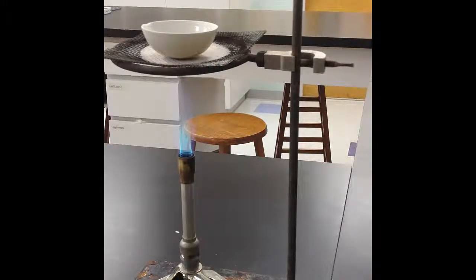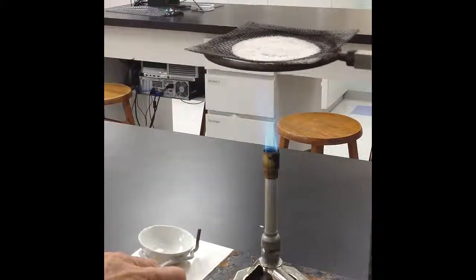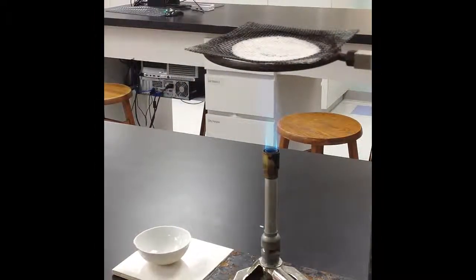Place one portion of each sample, one at a time, in an evaporating dish and heat gently to see if it will melt. If it melts with a gentle heat, immediately remove it from the flame. It may be flammable, and melted liquid could begin to vaporize and burst into flames.